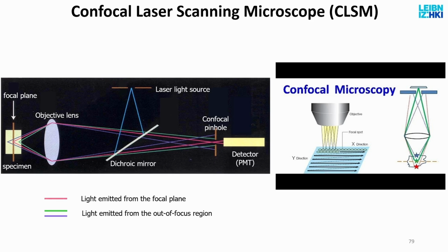So this is perfect, but it's not, because I lose a lot of light. But I can do that if I have a very good detector. Secondly, I'm only getting light from a very thin layer and from a very small spot, wherever the laser is here. And I cannot use an arc lamp because I don't have enough intensity. I use a lot of photons here. So I need a strong light source, and that has to be a laser.